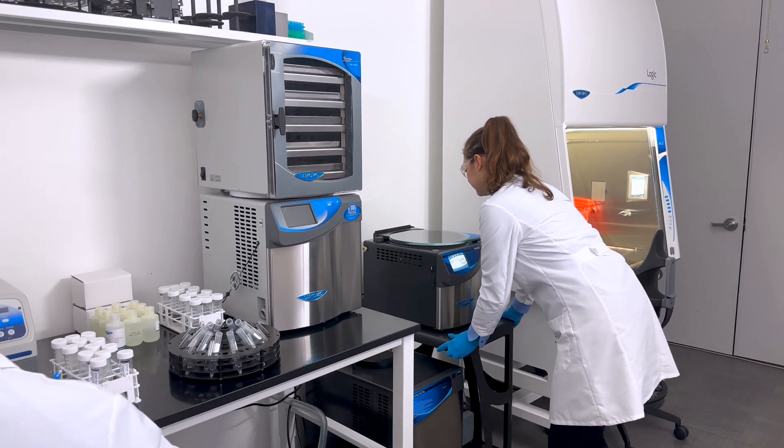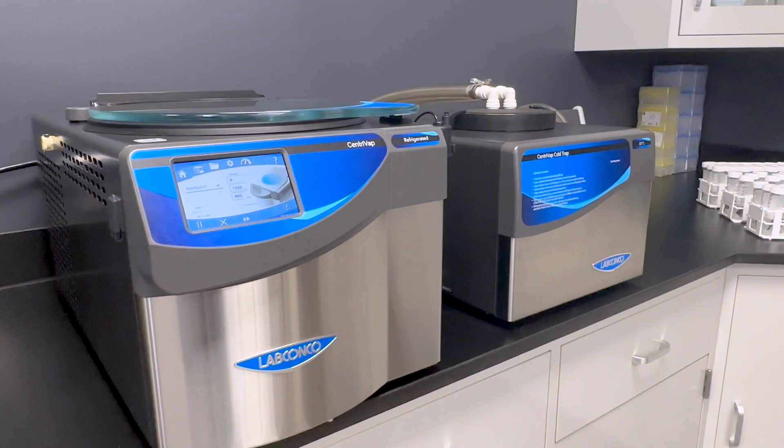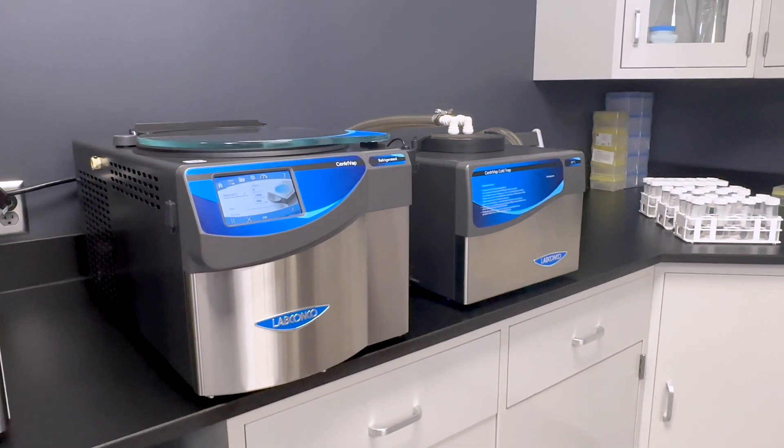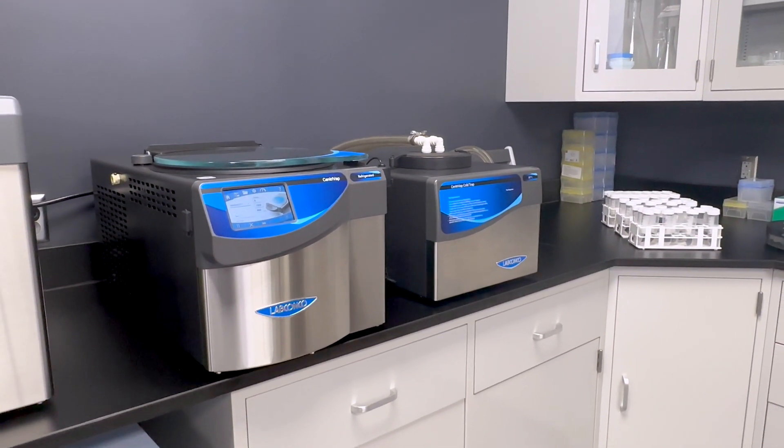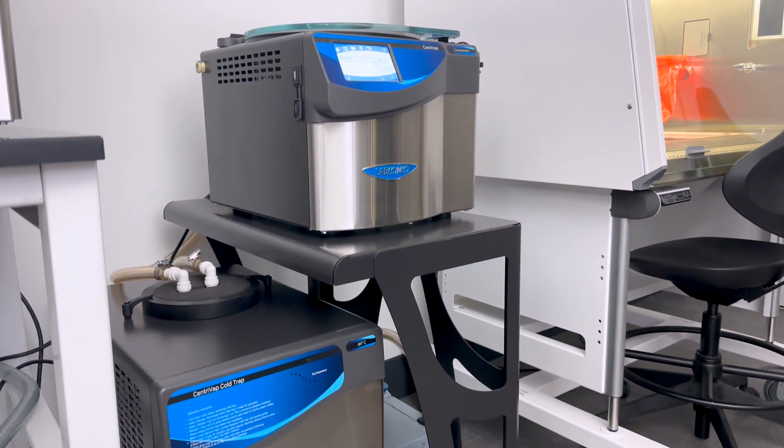In today's fast-paced research environment, efficiency isn't optional — it's essential. LabConco's new Centrivap Pro centrifugal concentrator is engineered to streamline your workflow, delivering faster and more precise sample concentration than ever before.